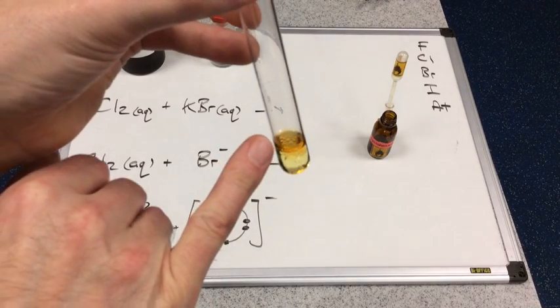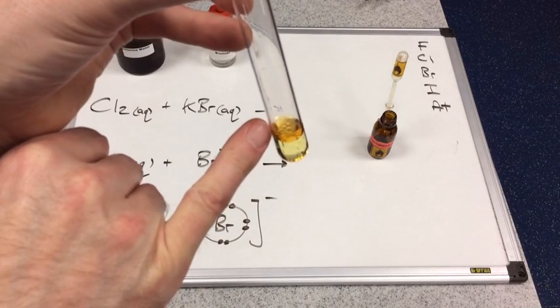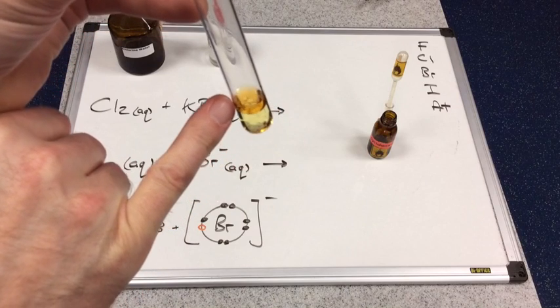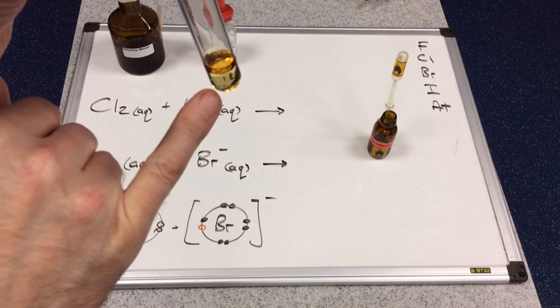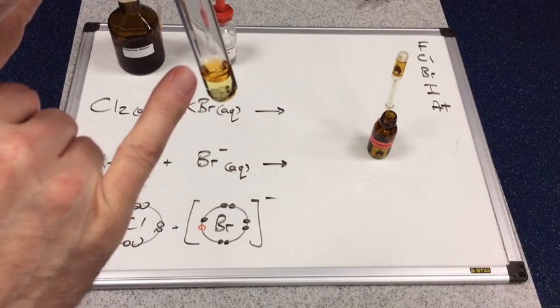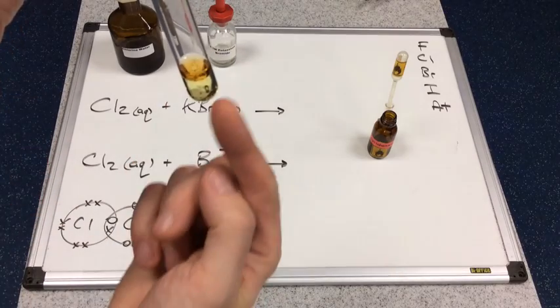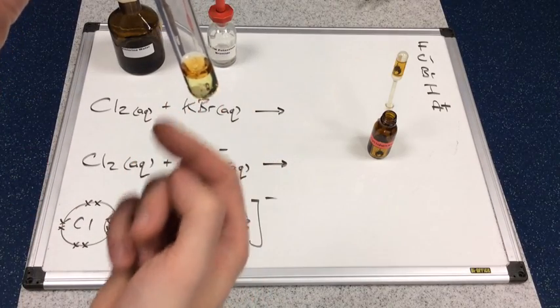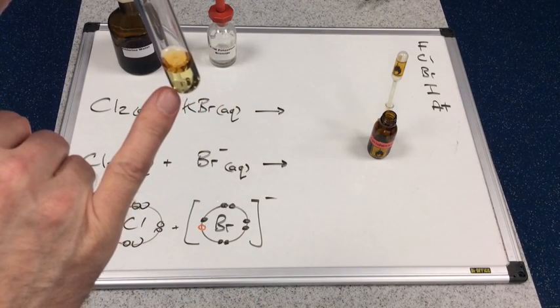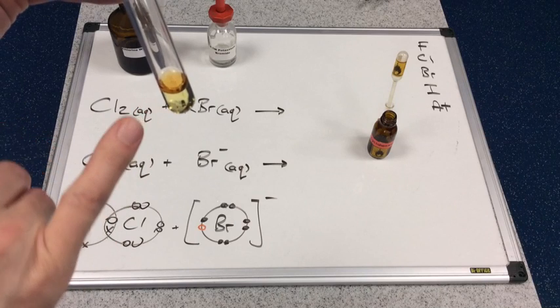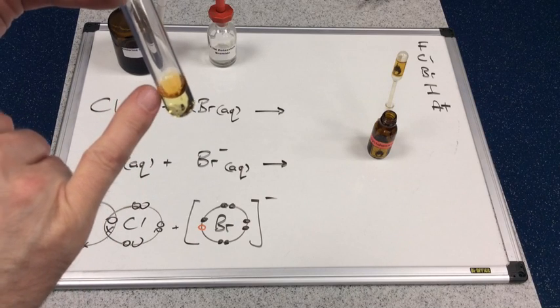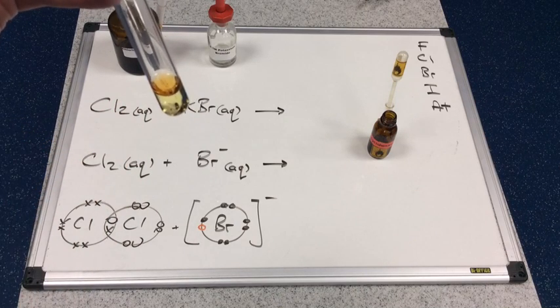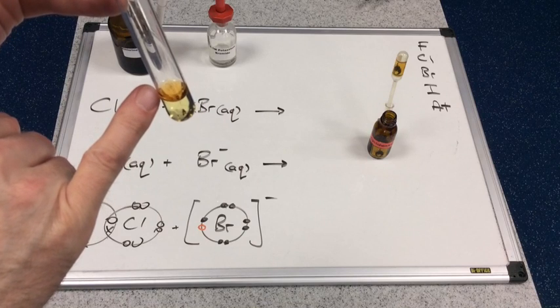Okay, so you can see we've got these two layers. We've got the cyclohexane layer, so that's the non-polar layer, and we've also got the aqueous layer. And you can see we've got different colors here. We've still got that original yellow color. It's actually got a bit paler, I don't know if you can tell. But we've definitely got a definite orange color inside this cyclohexane layer.